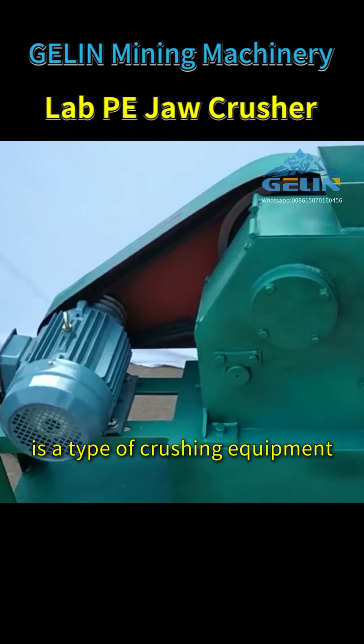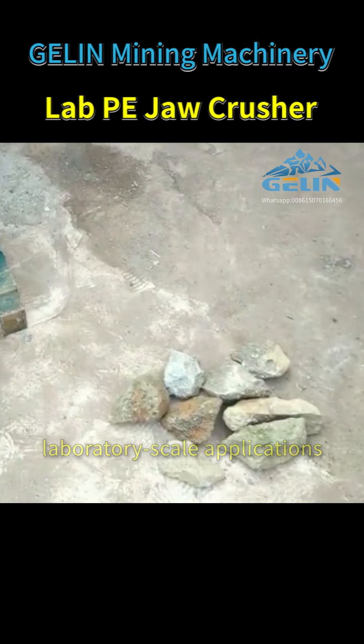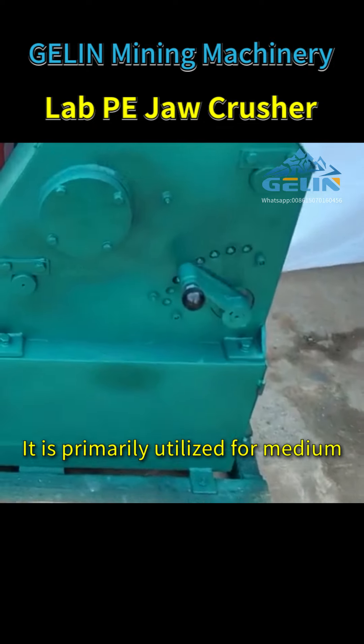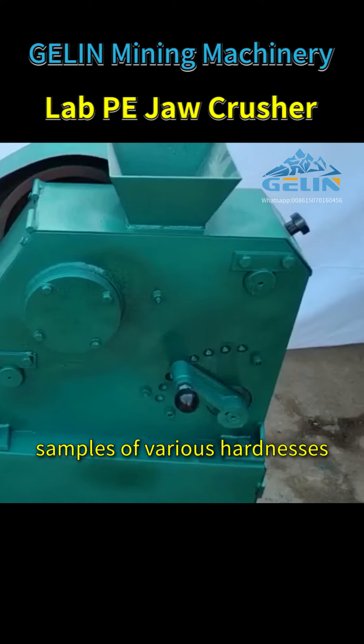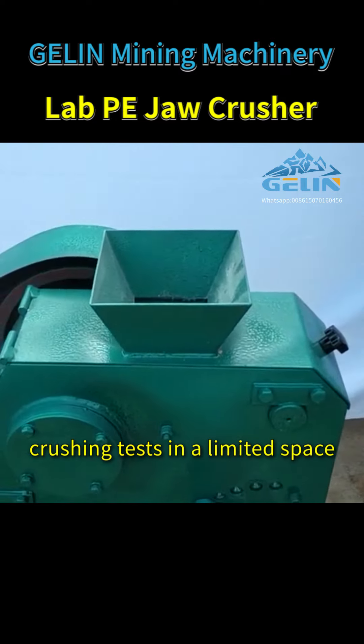LabPE jaw crusher is a type of crushing equipment specifically engineered for laboratory-scale applications. It is primarily utilized for medium and fine crushing of material samples of various hardnesses, and is suitable for precise material crushing tests in a limited space.